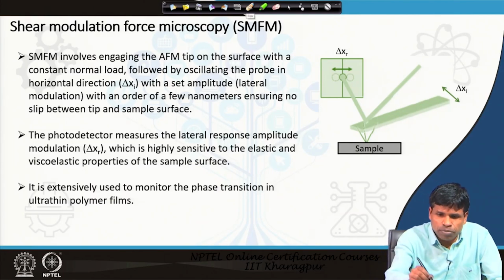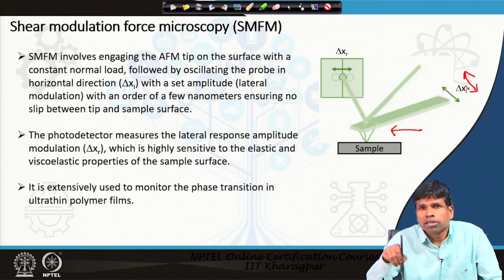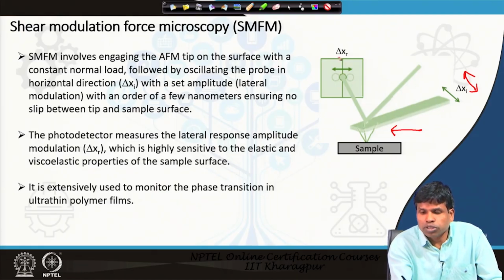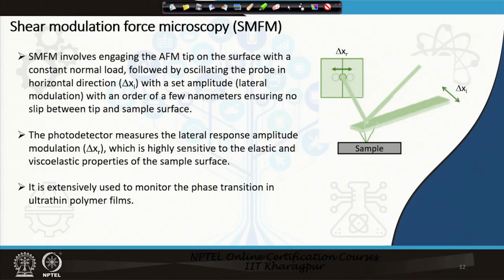As you see in this graph, a constant force is applied, and after putting the constant force, we give a particular modulation in the horizontal or lateral direction and study the response modulation. That is why del xr is given here: the lateral response modulation, del xr.